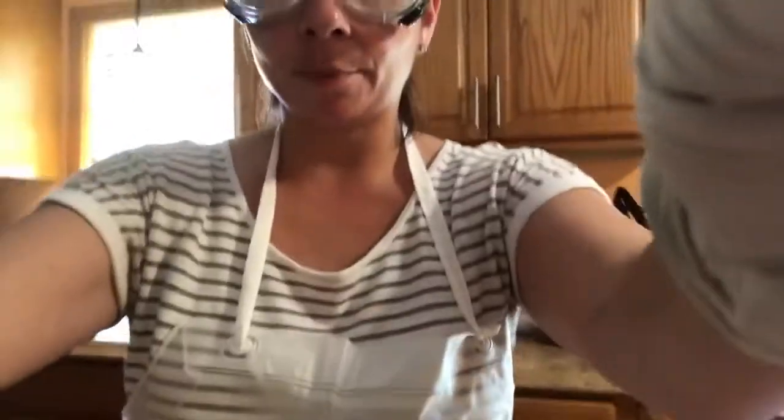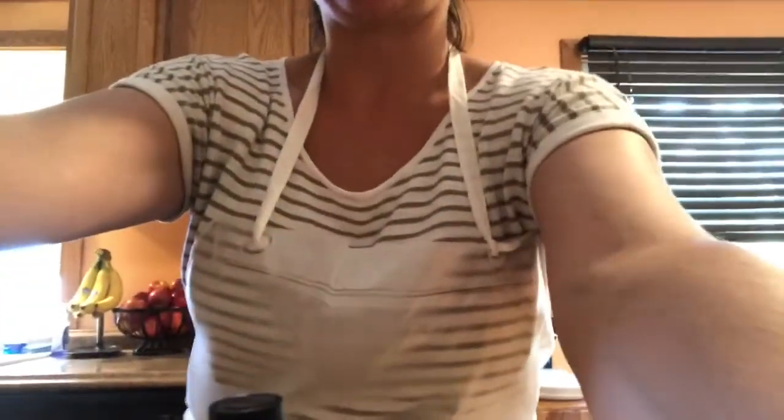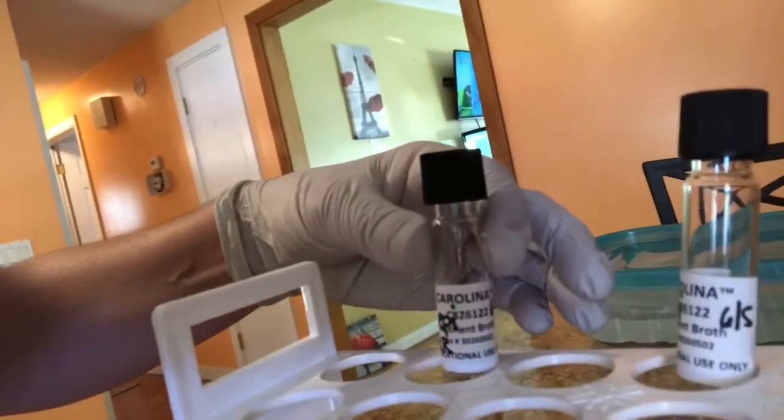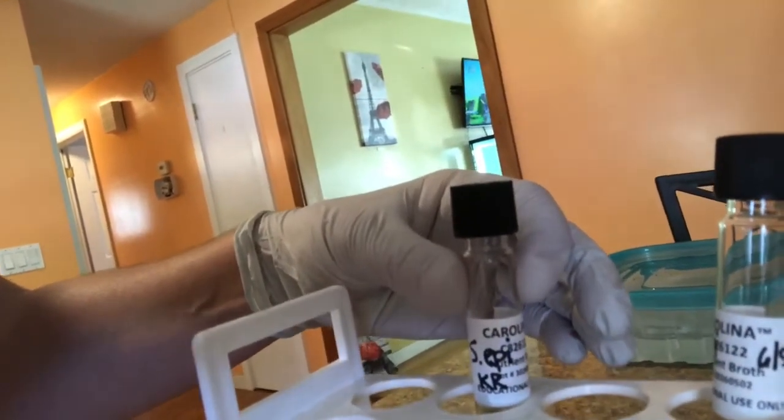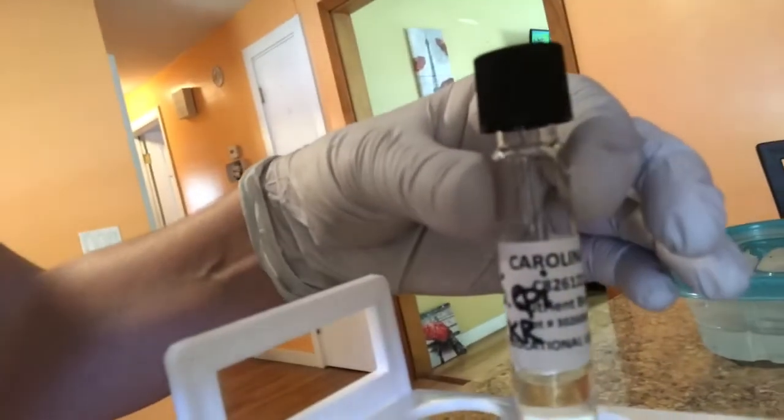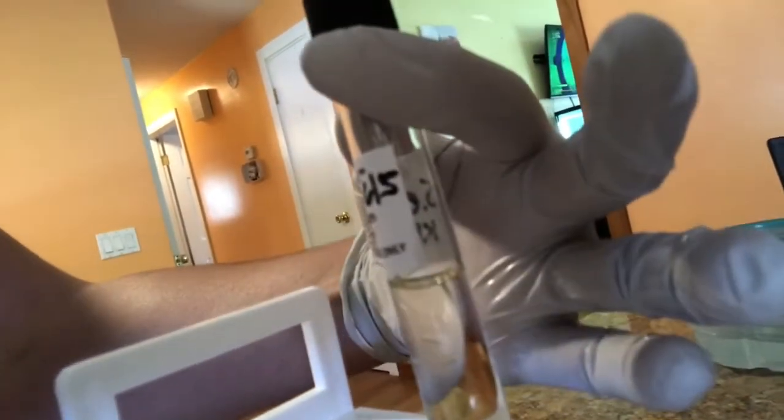Okay, so I'm going to attempt to set this up. I'm not having somebody record me. So I wanted to just show you first how the tubes are labeled. I opened them just ever so slightly so that I wouldn't have to do all that with one hand, right? So I did S. epi for the staph epidermidis, my initials KR, and then the date. The date is really important, right? 6/5, because I want to know if I end up putting it in the refrigerator like I did these cultures, I want to know how old they are. Okay, and then I did the same thing for the E. coli, and they're resting in here. So I'm going to prop this up here.